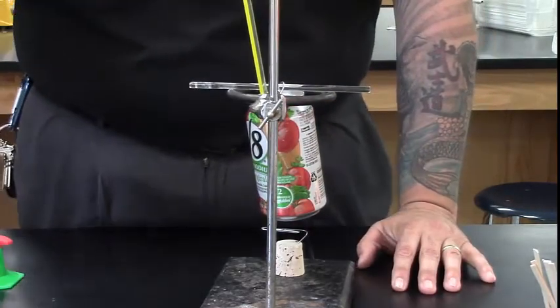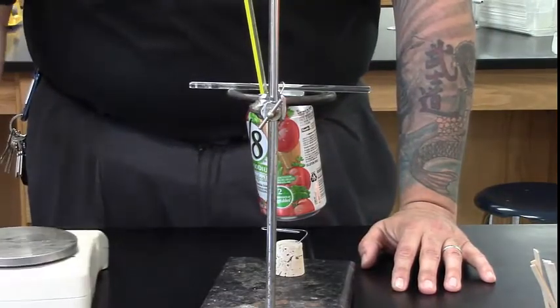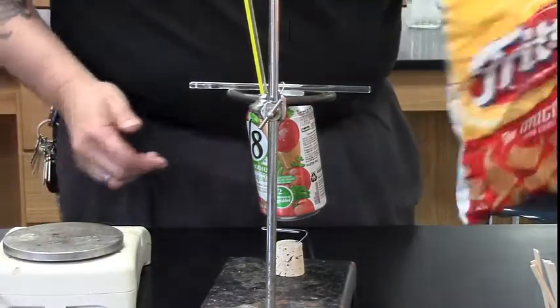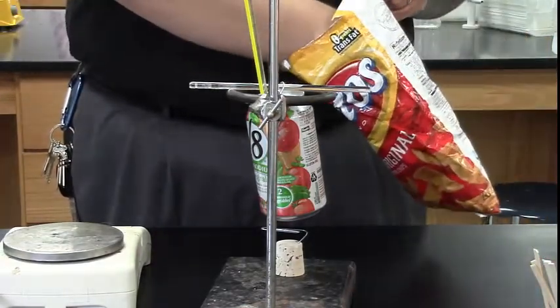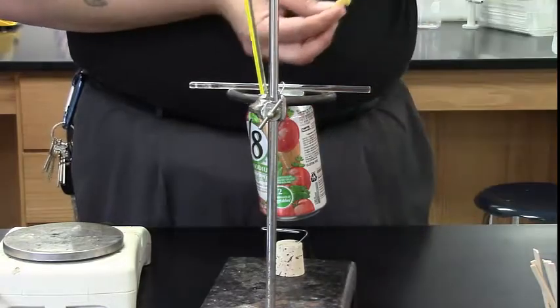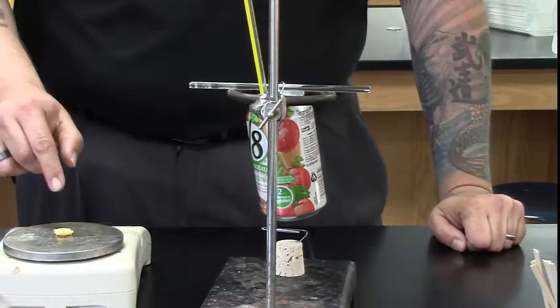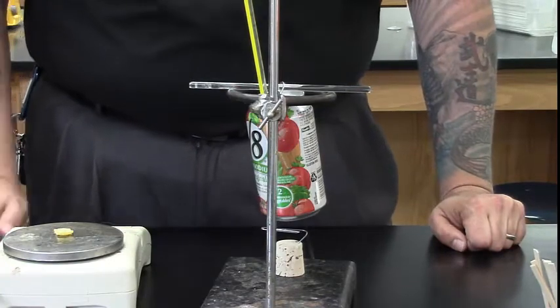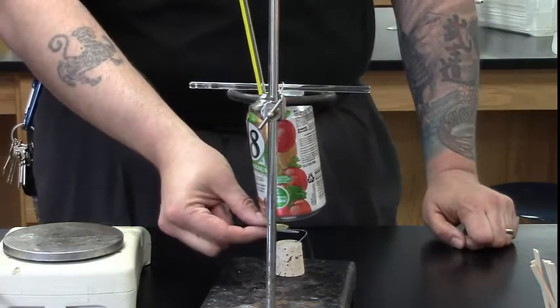While that thermometer is taking the temperature, we're going to get the mass of our piece of food — we're using Fritos. We're going to take the mass of the Frito before we do anything to it, and then put it on the food support frame.